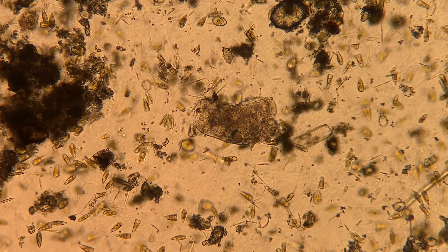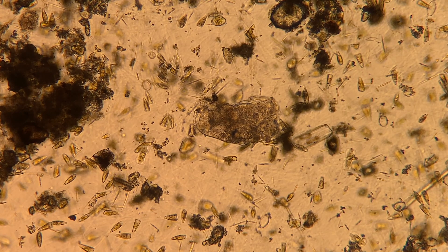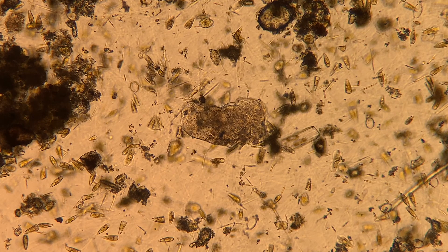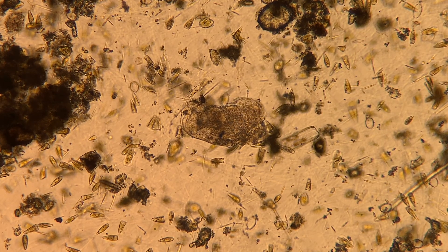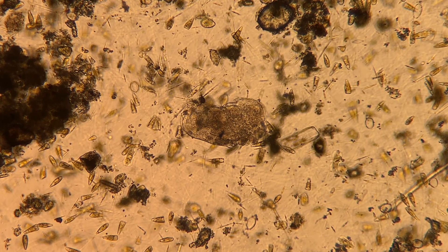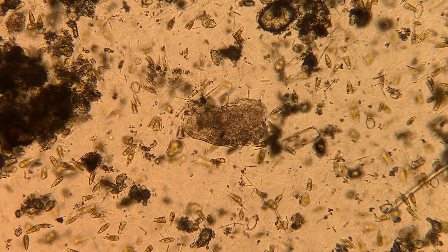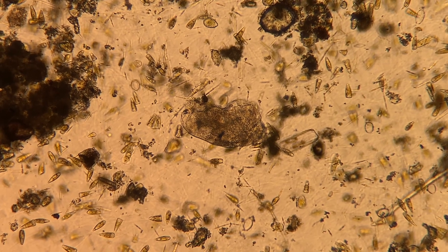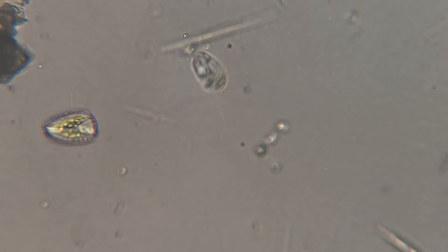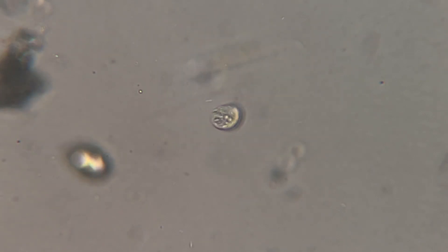I saw some familiar things and some unfamiliar things, but this one is the greatest mystery of all to me in this video. This guy in the middle kind of looks like he's hibernating, which might make sense because it's winter. I'm going to keep a hold of this sample vial — in case I see more of these guys, we'll see if they wake up and what they end up looking like. I don't believe it's a stentor. It might be some sort of tardigrade, but it is alive and it is moving. And other than this creature, which looks like it's hibernating, the only other thing that looked kind of cold was this little dude that was kind of shivering — but that's how a lot of protists just kind of swim around.